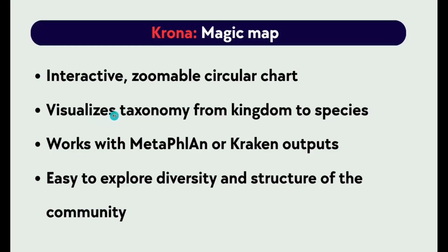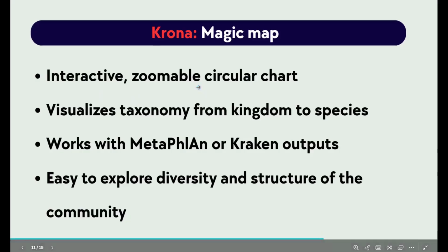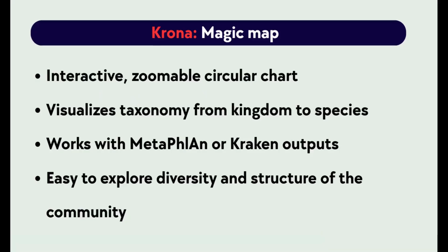And instead of just having some columns with numbers and identifications or taxonomy IDs, we will have a circular map where microbes can fit, to imagine where they lie in the greater picture, in the greater biological picture.